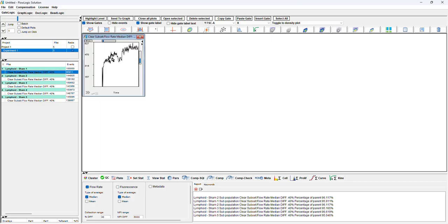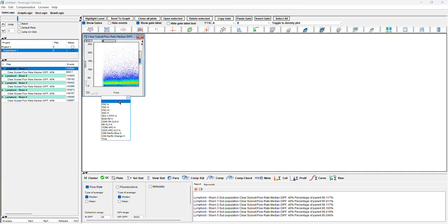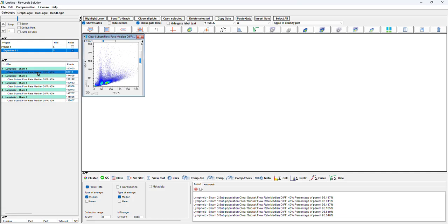The new gate, this is a normal gate. So now you start to see our plotting tool, density plot. Probably it is the case to get FSC and SSC. This is normal, and these we are on clean.